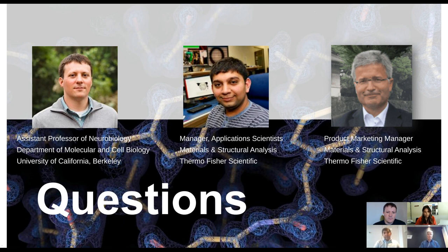In case of GABA receptor, where there is a lower symmetry, some more flexibility, some more challenges, the difference starts to become slightly bigger. On the Glacios with Selectris, we get 2.4 angstrom. On the Krios with a bottom-mounted Falcon 4, we get to 2 angstroms. And on the Krios with Selectris and Falcon 4, we push it to 1.7 angstroms in case of a symmetric form of GABA.